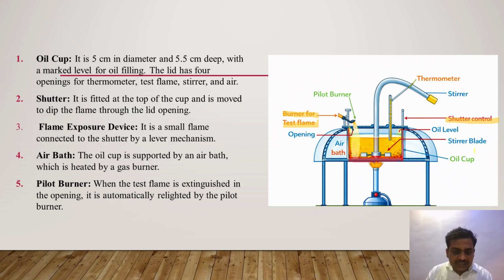The next part is the air bath. The oil cup is supported by the air bath, which is heated by the gas burner. Means from the bottom, the burner is there, and it is used for heating.